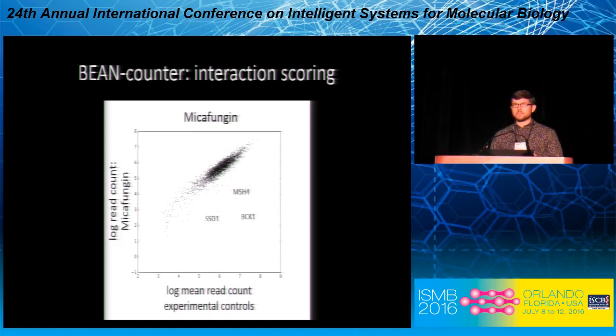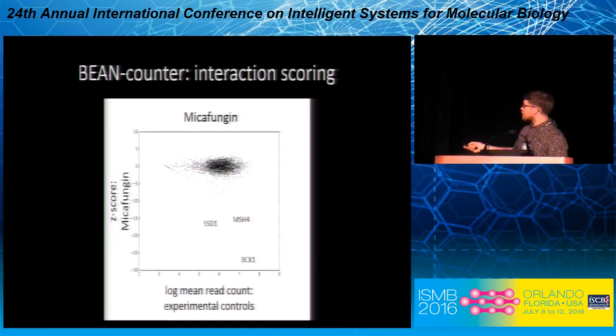In RNA-seq, we know that variance as a function of read counts is an issue. We definitely take that into account, so we get a continuous estimate of variance as a function of the read counts. At the end, we get chemical genetic interaction z-scores, plotted here against the mean profile again, and these are the z-scores that we then take into further steps of the pipeline.